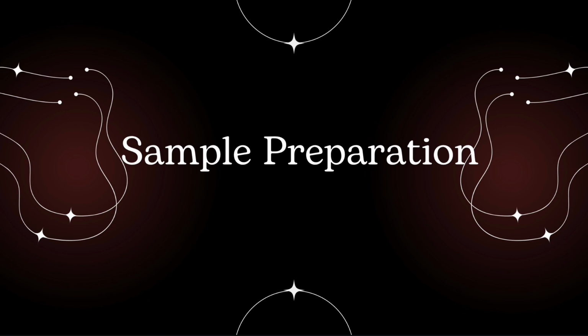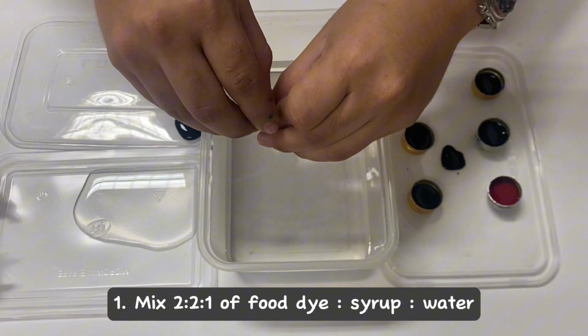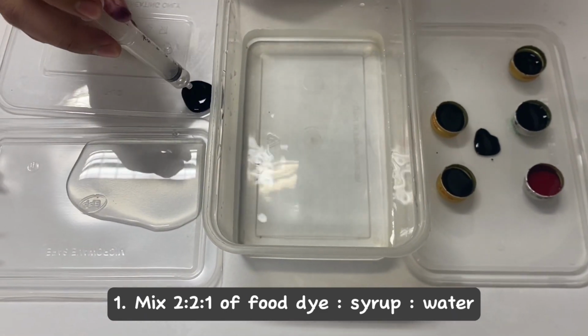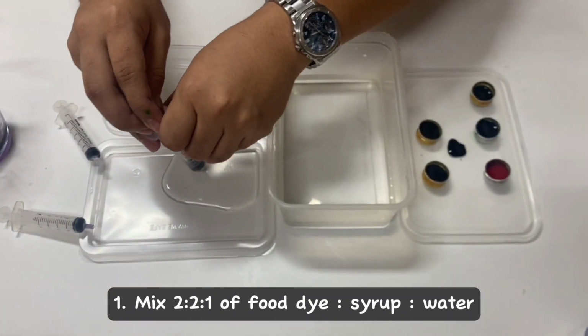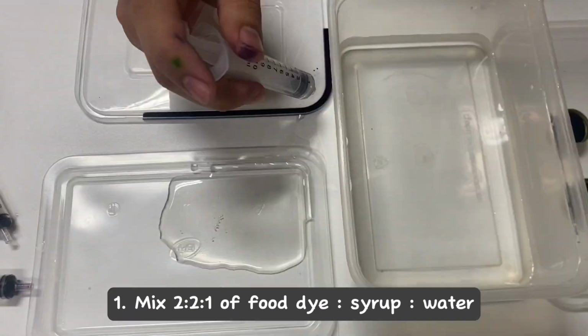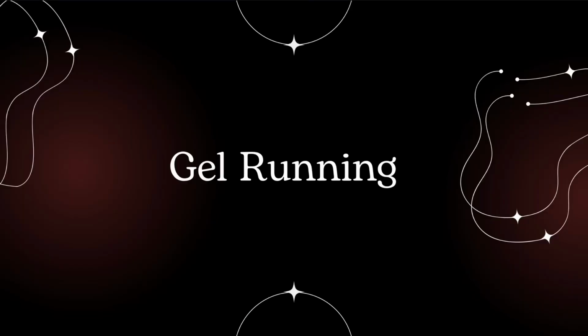Next, sample preparation. This is the method to run the gel.